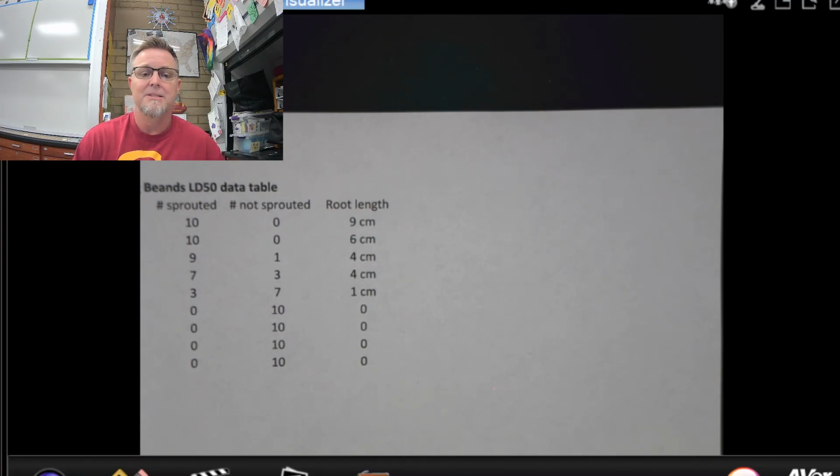All right, gang, so that's how to do a serial dilution. That's the experiment. This is your sample data. It's now up to you to generate that lab report and see what conclusions we can make about the LD50 for table salt and its effect on mung beans. I hope that you learn a lot through this. It's a really, really important concept when it relates to saltwater intrusion.